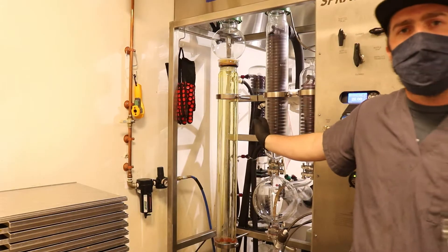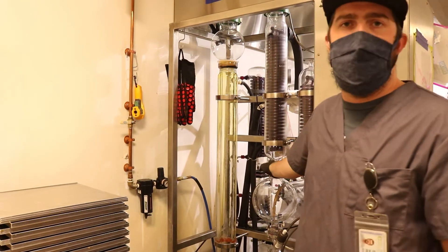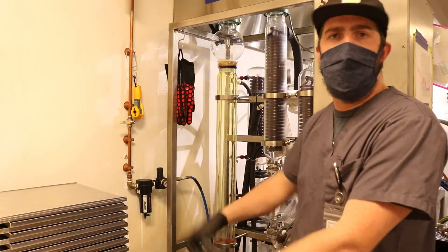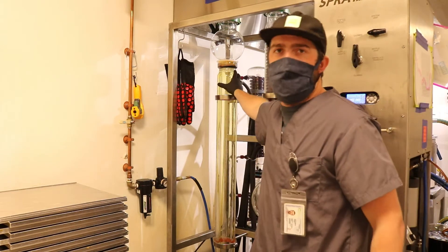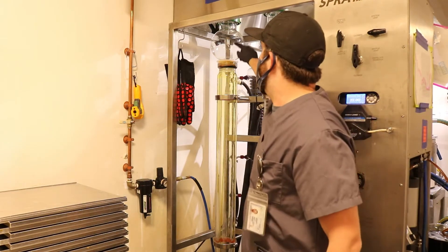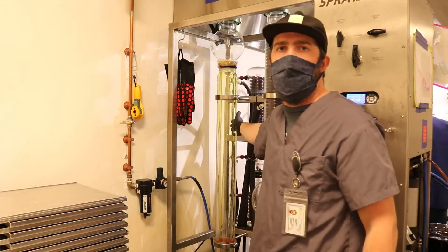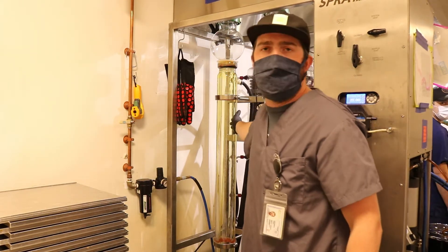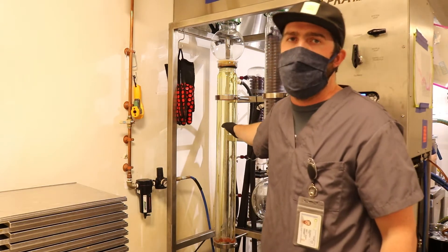This is the spray bath — it's another distillation setup. Instead of a rotovac that uses a heated water bath and rotating of the boiling glass, this uses thin film distillation. The extract will come out of this nozzle up here, spray down this column which has a heated water jacket, which increases the surface area and allows for a more even, quicker evaporation process.